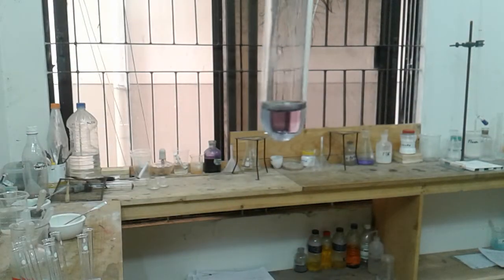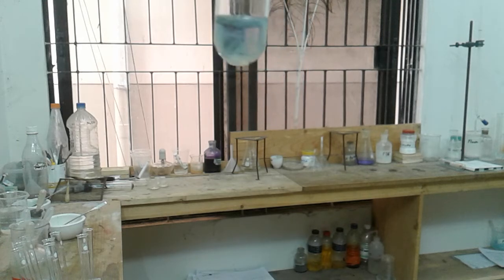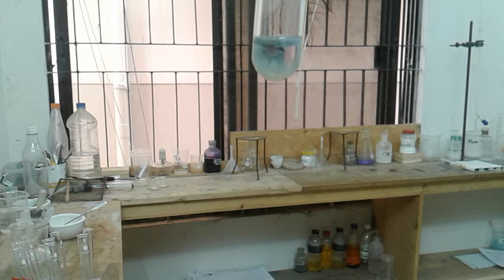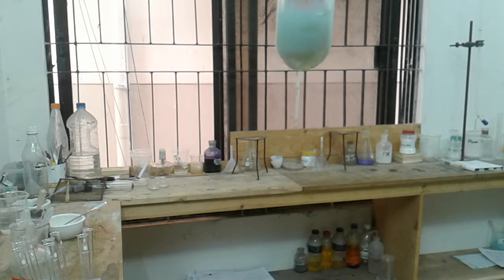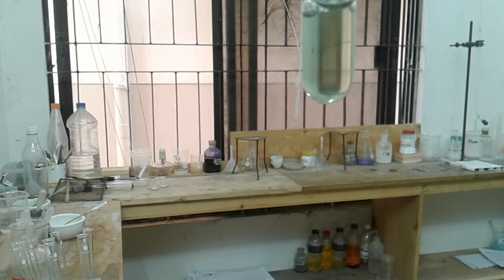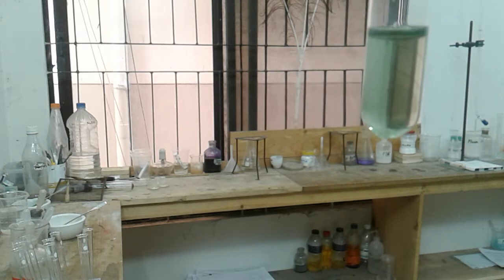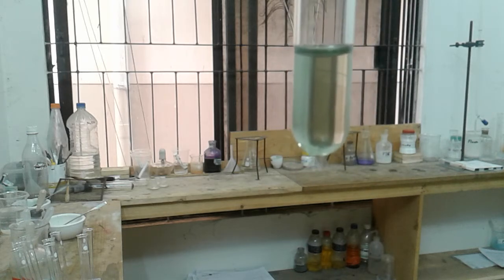So first, just look. First I will be adding a few drops. Look, a precipitate started to form, which is also green in color, isn't it? It's green, dark green. So now I will be adding excess. Still, oh, the precipitate is going away. Oh, okay. So the precipitate formed is a green precipitate which dissolves in excess to give a green solution.